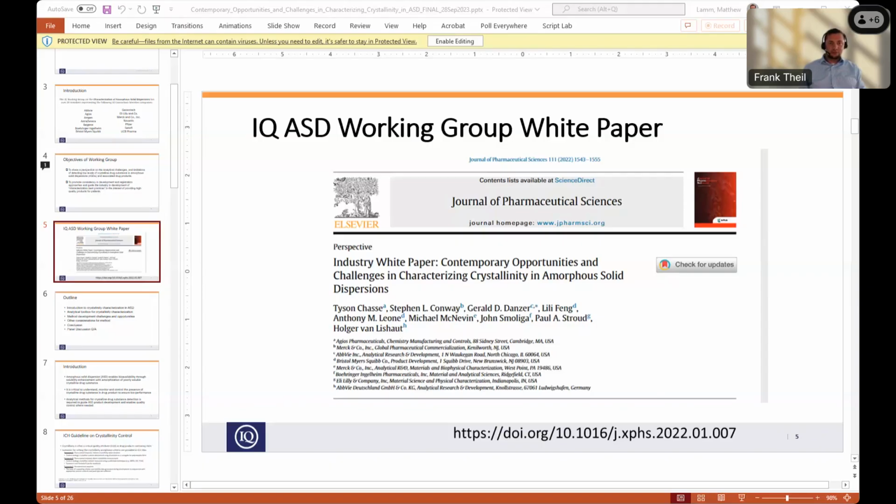Great, thanks. There's a question, and I'll open this up for anyone on the panel, around using total X-ray diffraction for characterization. Anybody have any experience using total X-ray diffraction as a tool for detecting crystallinity? Is it widely used? That's basically the question.